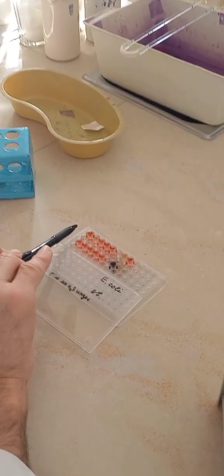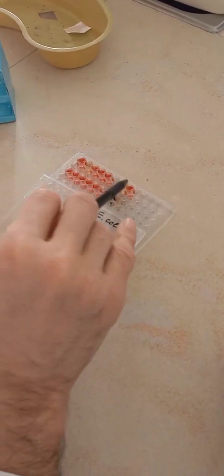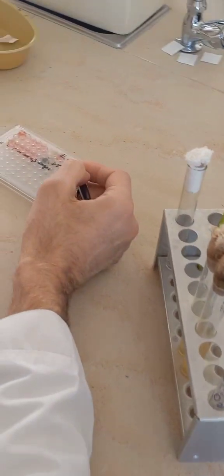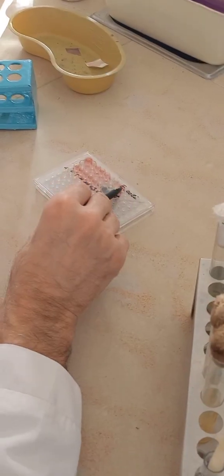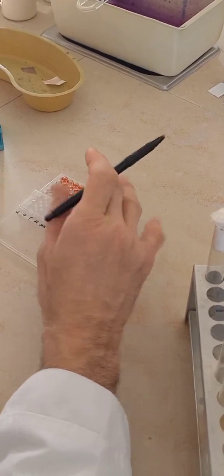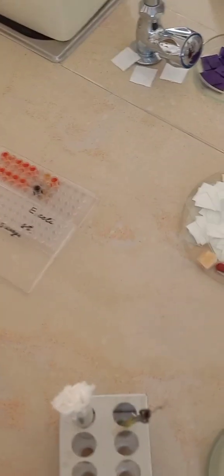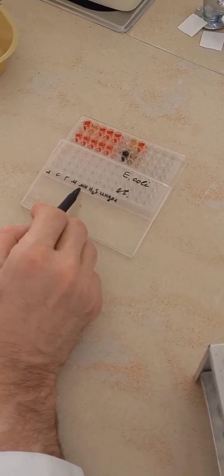Left side will be sugarlytic activity, meaning carbohydrate fermentation. This will be proteolysis. And our laboratory assistants already indicated even the species level of bacteria. Upper row E. coli, this is the genus name, Staphylococcus for the previous one. So which conclusions can we make from this? So here, by the way, the sugars' names, for those who stand nearby me: lactose, sucrose, glucose, maltose, mannitol.